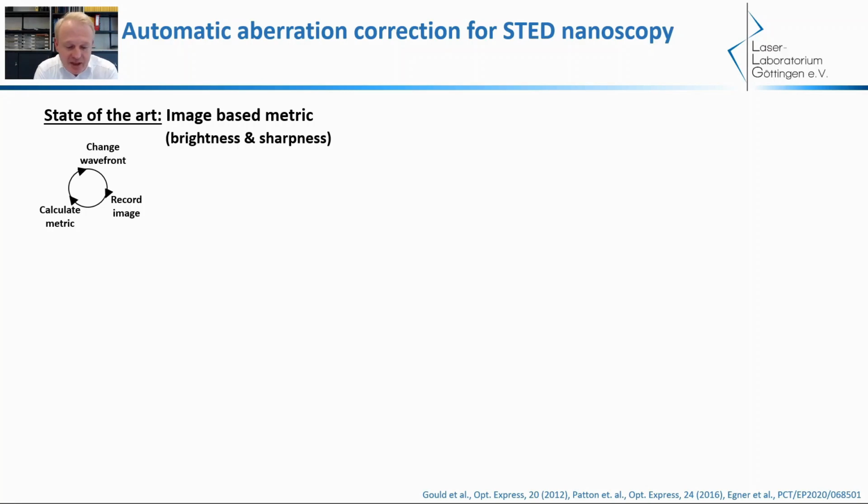But a Hartmann-Shack sensor, when we are working with fluorescence, has some shortcomings because we have to distribute the fluorescent signal over a large area, because a Hartmann-Shack sensor is working with micro lenses, and it always has to image certain parts of the wavefront. So it means we need a lot of fluorescence to get a decent image to analyze the aberrations. And of course the fluorescent photons we use for measuring the aberrations cannot be used for imaging anymore.